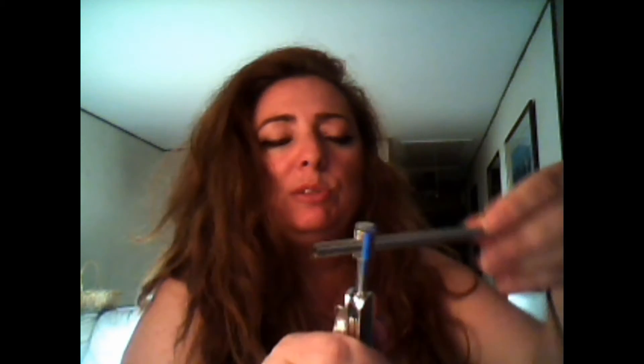The microscope also comes with a couple of attachments — I haven't used any of them yet. They're all different sizes. There's even one that has a mirror on it, so if you're going into something tight, you can use the mirror to see it. Maybe for pipes? Not sure why you'd need that, but I'm sure there's a reason.